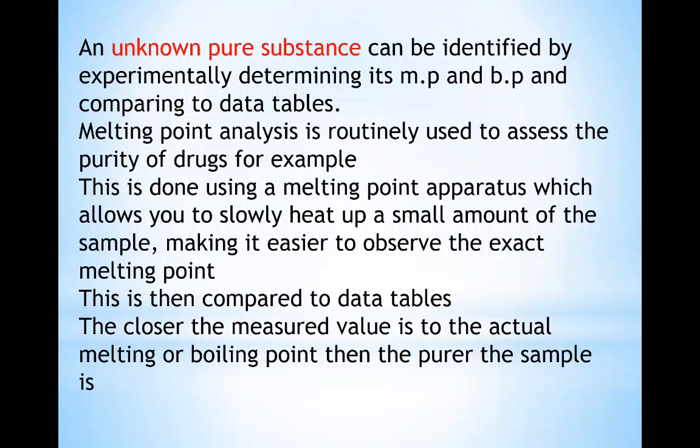Melting point analysis is routinely used to assess the purity of drugs. For example, this is done using a melting point apparatus which allows you to slowly heat up a small amount of the sample, making it easier to observe the exact melting point. This is then compared to data tables. The closer the measured value is to the actual melting or boiling point, the purer the sample is.